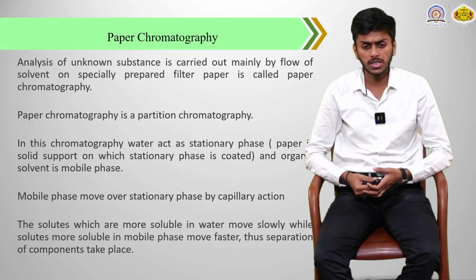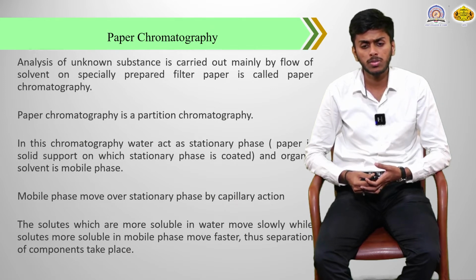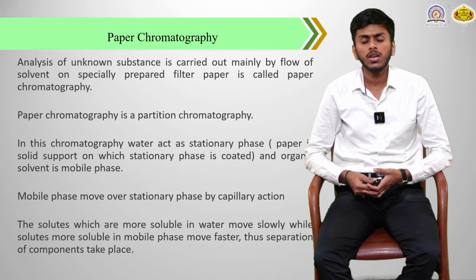Mobile phase moves over stationary phase by capillary action. The solutes which are more soluble in water move slowly, while solutes more soluble in the mobile phase move at a faster rate. Thus, the separation of components takes place.